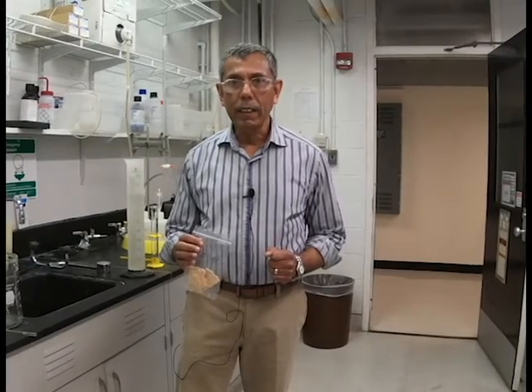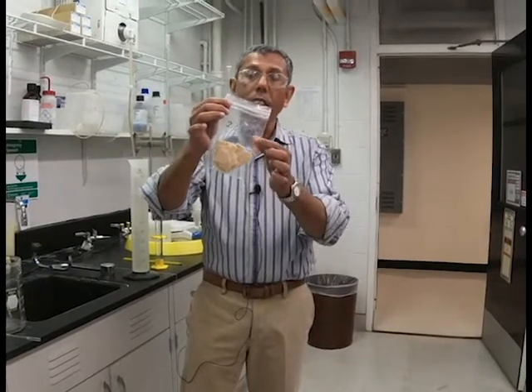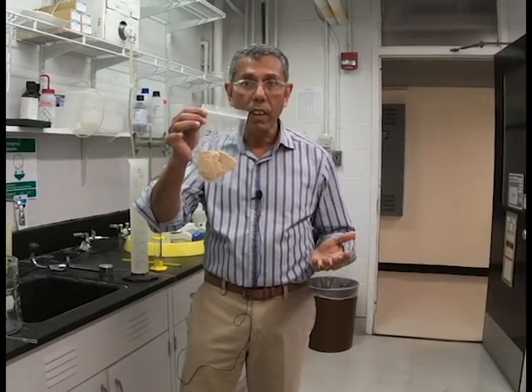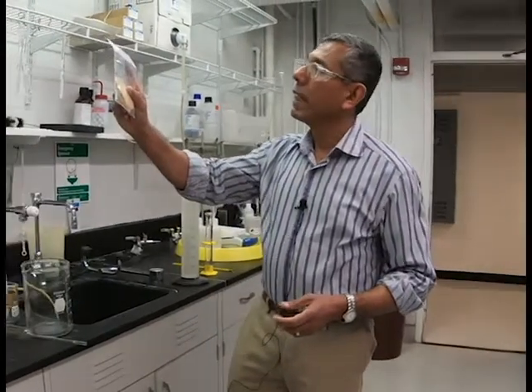What we're going to do in this lab is measure the kappa number of this pulp. To measure the kappa number, you have to weigh out some oven-dried pulp. In this case, we had a guess of 25 for the kappa number, so we weighed out two oven-dried grams of pulp. You can see this is some softwood pulp because I can see the long fibers in it.